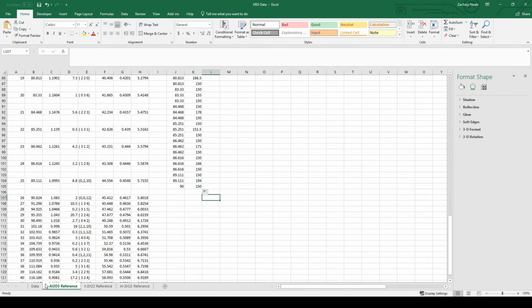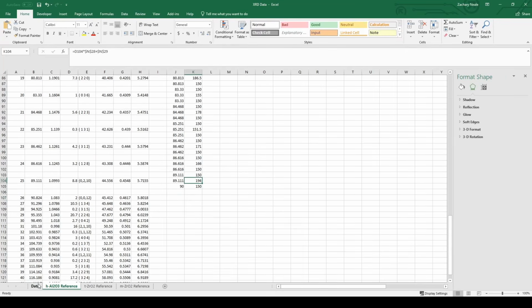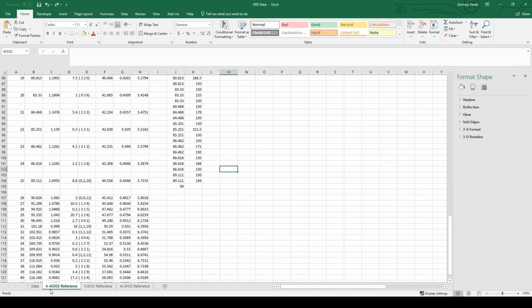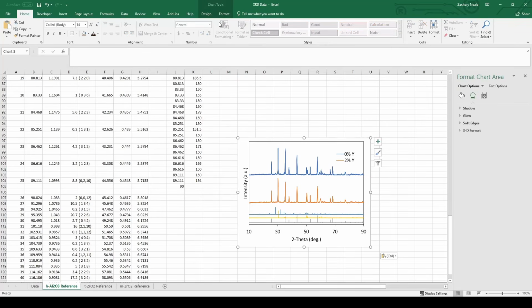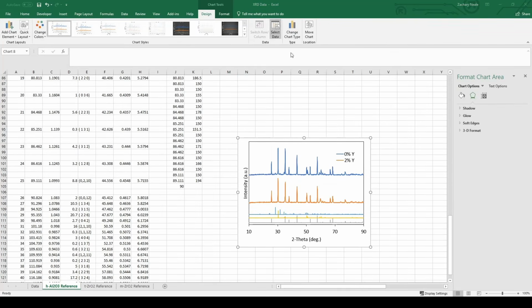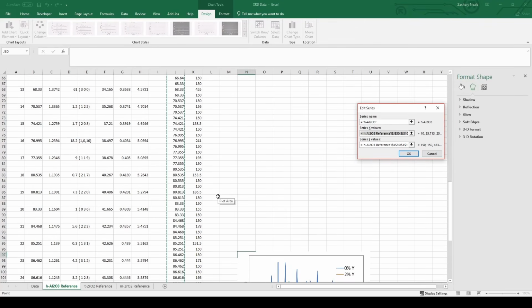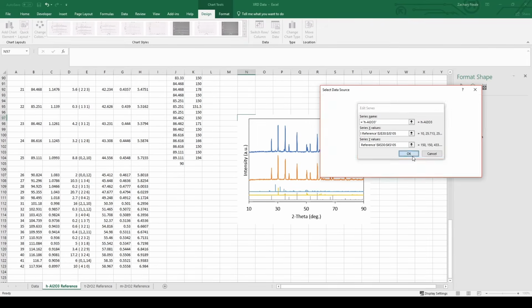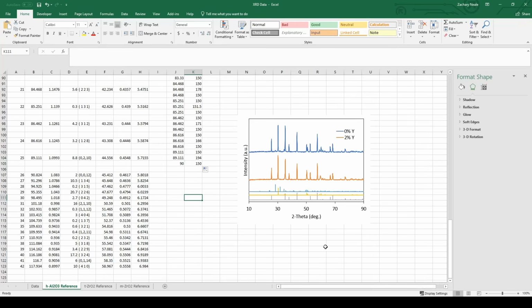So it looks a little bit better. Change this. Okay. There we go.